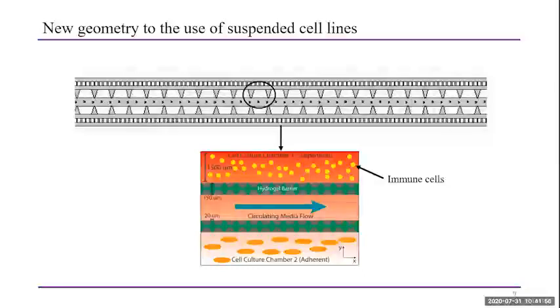to allow for the gelation of the hydrogel, and also to flip that geometry to switch from that hexagonal shape to the trapezoidal shape. And so in allowing the hydrogel barrier to gel, it will act as a fence to keep the middle channel from flooding. And then with the flip in geometry, we anticipate that it will alleviate an issue we were having where bubbles were forming from surface tension. And so I circled the hydrogel barrier. And so that's where that will act as the fence for our device.